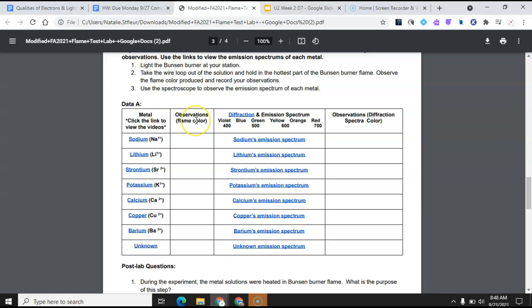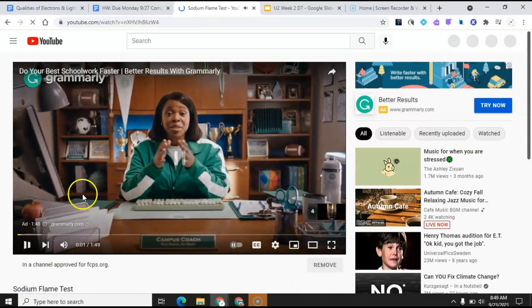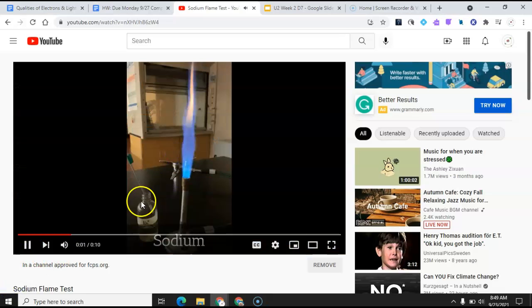First, we took the metal and placed it in the Bunsen burner flame, and we just looked at the color of the flame. If you were absent, or even if you wanted to check your work, you click on the link and it'll take you to, oops, this is a video. Okay, we're back. Sorry about that.